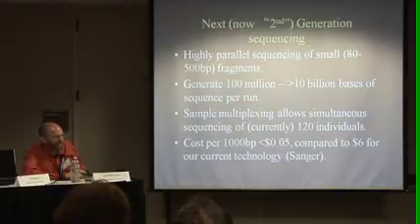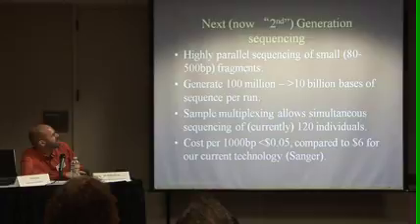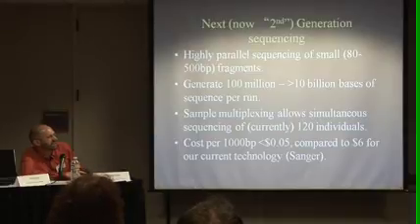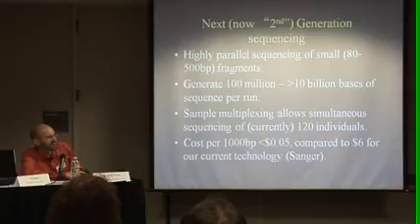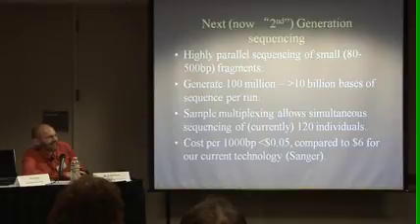So, getting back to the technology, next generation sequencing is this highly parallel sequencing technology of small fragments of DNA, where you generate literally hundreds of millions to billions of sequences in a single instrument run. Because you're generating so much data, it's actually more data than we need for these types of projects. These were developed primarily for sequencing whole genomes, where you're talking about 3 billion base pairs in a mammalian genome. But we're not interested in doing that yet for cetaceans. Well, at least that's not what our lab's going to probably be doing.